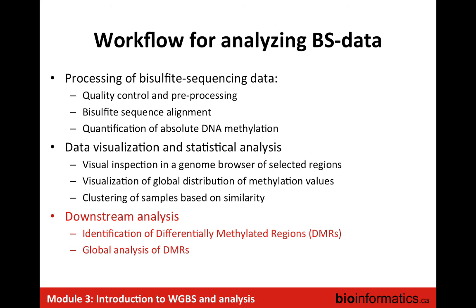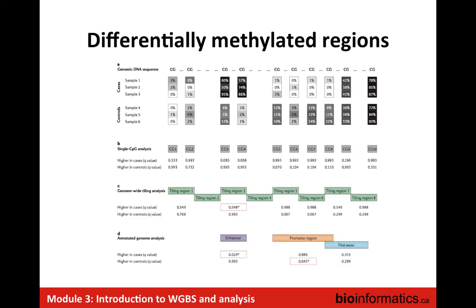So all of this so far was really done at the level of individual CpGs, and typically, a lot of the analysis on methylation is not done on the individual CpGs, but more on trying to look for regions that are differentially methylated. So here's a slide that shows this a little bit.